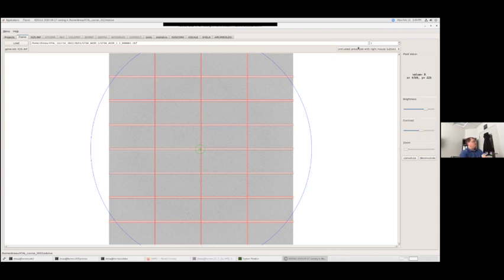You can also draw any regions you want to mask off with the untrusted region, either as a rectangle, an ellipse, or a quadrilateral. So the way to do this as a rectangle is you just pick a spot, think of it as one corner of the rectangle, and then the second corner. So that first click, and then drag it out to the size that you want. I'm just going to put it inside of one of these gaps, and then the second click should define that.